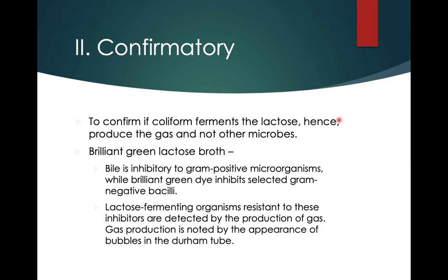Bile, which is present in the medium, is inhibitory to gram-positive microbes, while brilliant green dye inhibits selected gram-negative bacilli that are not really coliforms. So the dye and the bile are very important constituents. Of course, the lactose serves as the carbon source, definitely.